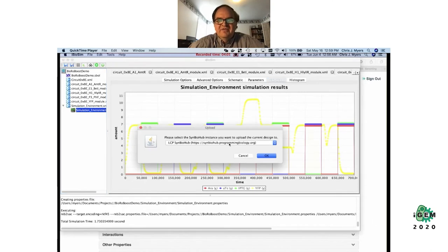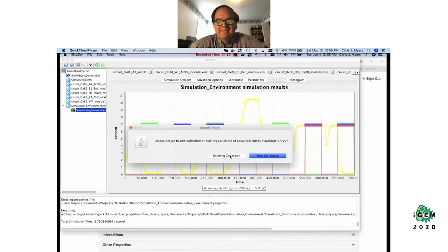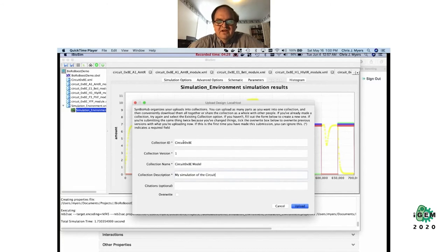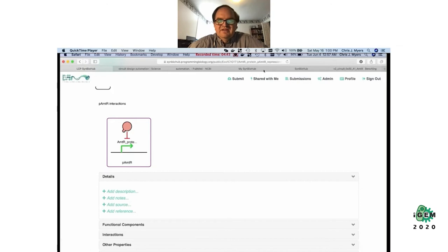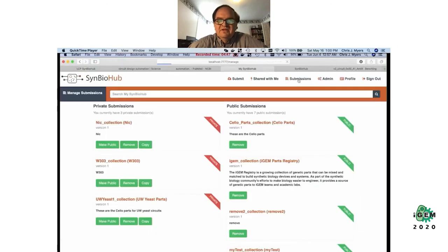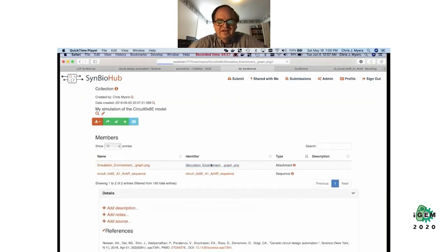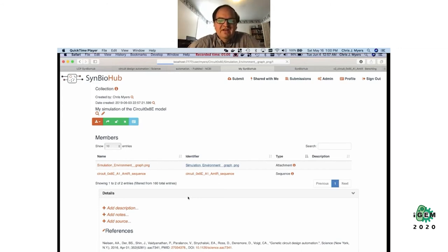I'm doing an ODE simulation and here's the result — it's stepping through different input combinations. You can look at that and see if that was the circuit behavior you wanted. When you're all done you can share this with somebody else by sending it to SynBioHub. I'm uploading the simulation information, describing my circuit 0x8E model. I can add in the PubMed ID for the Cello Science paper, and when you go over to SynBioHub you can see that the information has been uploaded, along with the simulation plot and the citation.